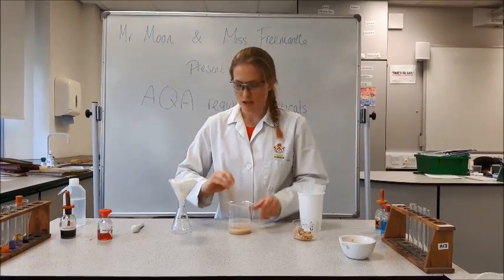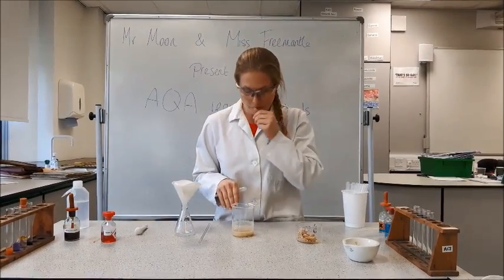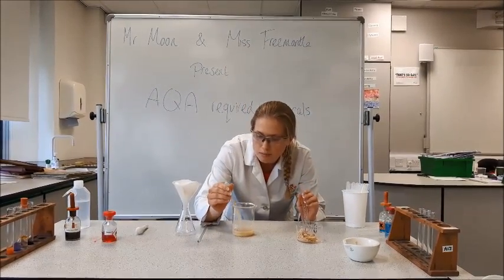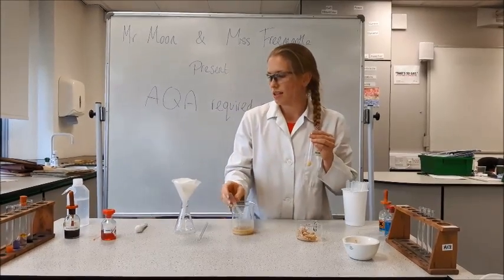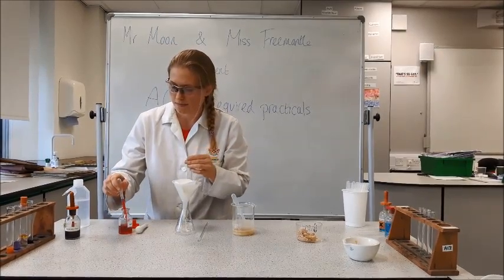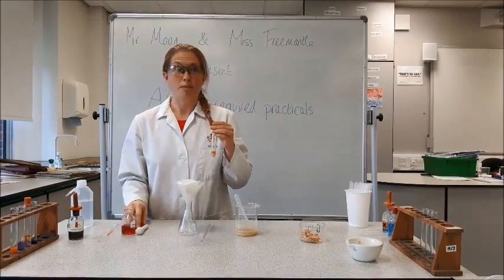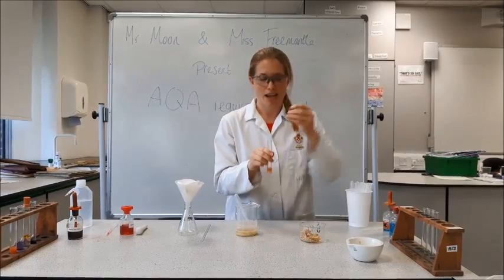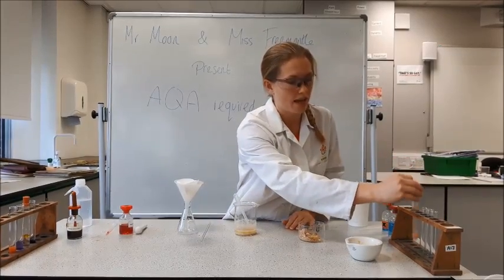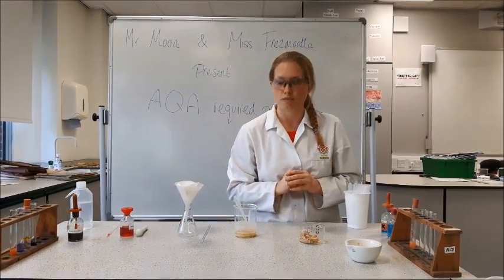Once we've got a good mix, the first thing we're going to do is test for fats. We're not going to filter the solution yet — we're going to take some of the solid straight away and add it to our test tube. Then we're going to add about three drops of Sudan 3, place a bung in the top and give it a good shake. Hopefully any fat molecules present in the biscuit are going to separate out and attach to the Sudan 3, and we'll see some little red flecks at the top.